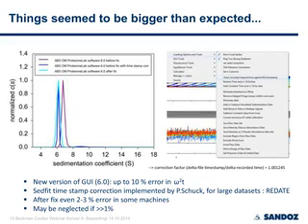you may check your GUI and your software if you are really on the current state. If this is the case, you usually can neglect it. Otherwise, you can simply correct it using the Sedfit function.